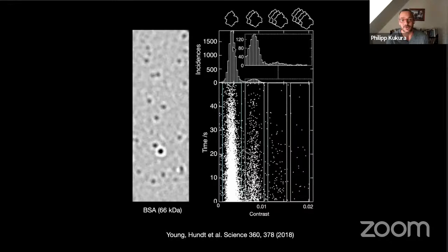The big advantage is how it works. Right. One more thing, Phil. It's a wonderful opportunity for polymer chemists, because the polymer problem of synthesis is it's polydispersed, for whatever method you use, and Satish will speak for it. Satish himself is a polymer chemist synthesizing these conjugated polymers in his lab, but he also knows how hard it is to get monodispersed polymers. And the quantification of the polydispersity is something that I think you guys can do here.